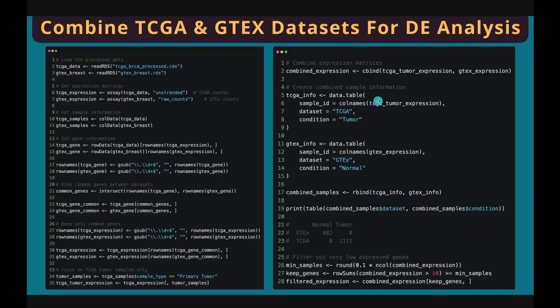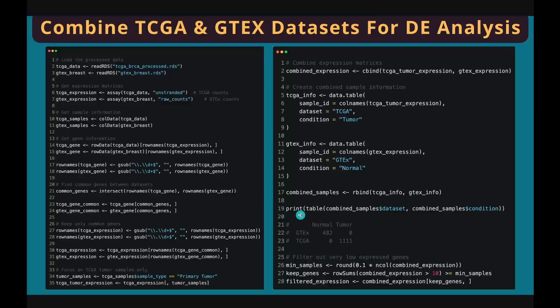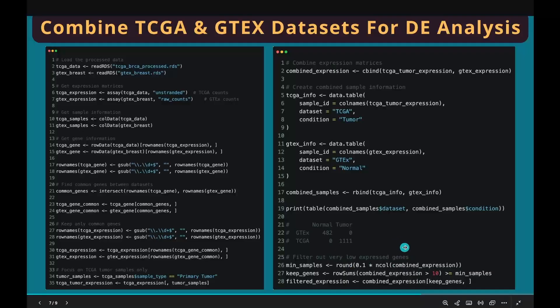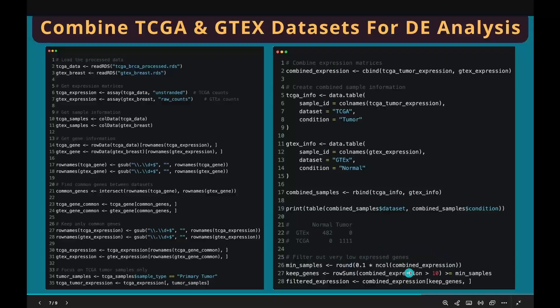Next, we create a sample information table for each dataset and combine them row-wise using rbind, which means stack them up. You can check the number of samples in the combined sample information table using the table function. Lastly, let's do some QC by removing low-expressed genes. This code means we only keep the genes that have the expression value greater than 10 in at least 10% of the samples in the combined gene expression matrix.